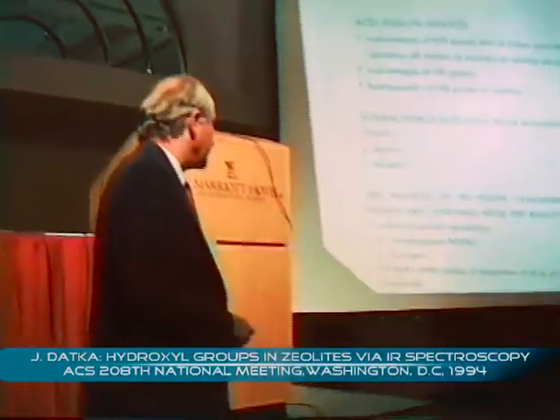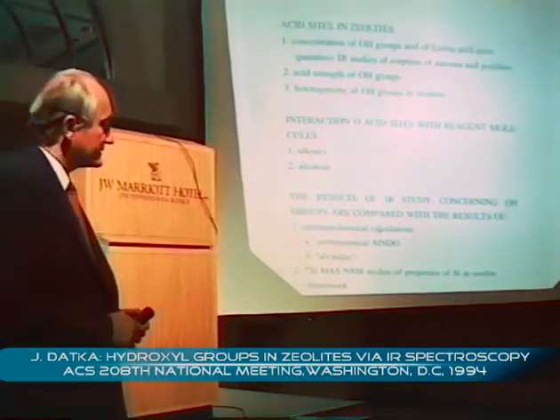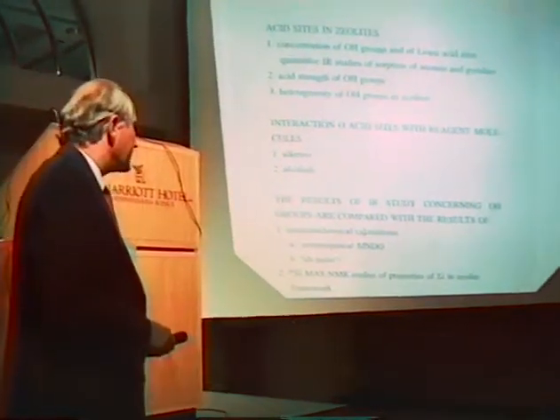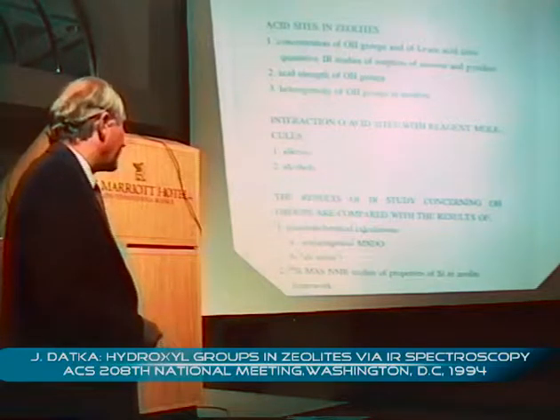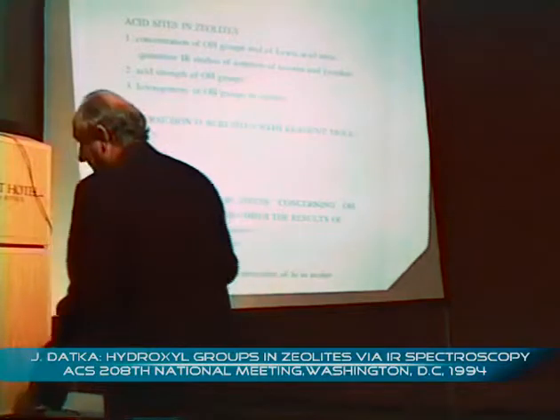from IR. We also compare our IR results concerning hydroxyl groups with 29Si magic angle spinning NMR results of silicon atoms in the zeolite frameworks. I shall present an example of such a comparison.